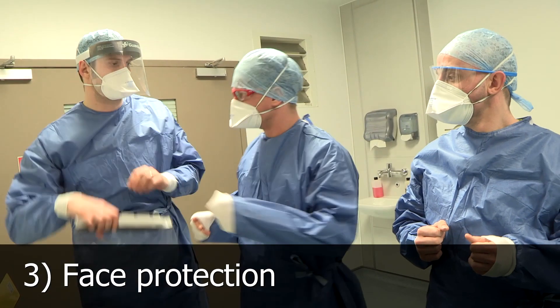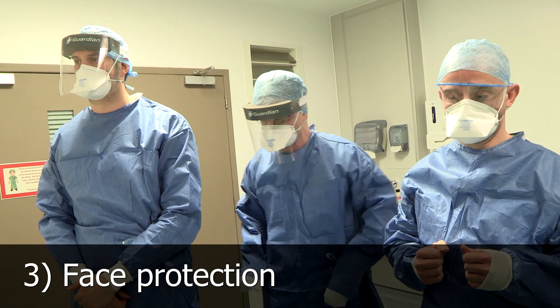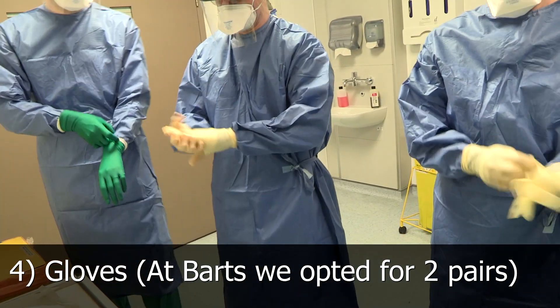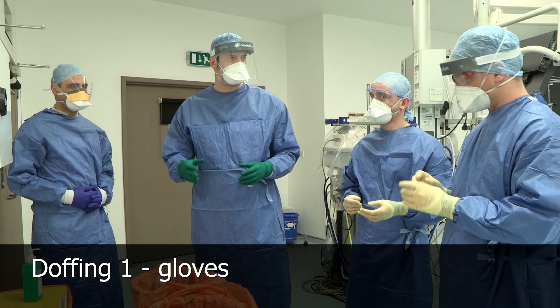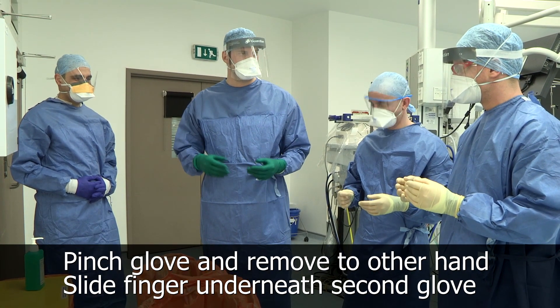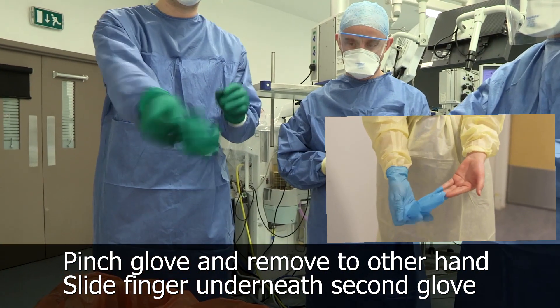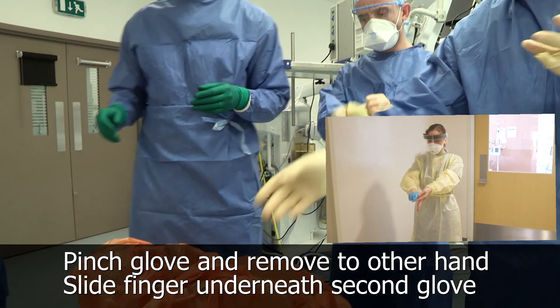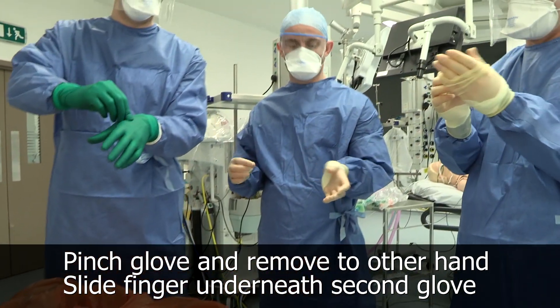All in one without touching the outside, straight into the bend. And then because we're double gloving for this procedure, we repeat the same process.